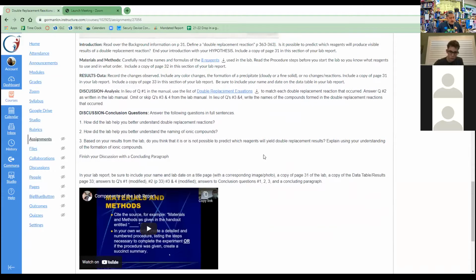Okay, so let me get a well plate, and then we'll get these chemicals together and see what happens. Okay. All right, I don't have my 96 one, but I have the other well plate. Oh, and I don't have the camera up, so let me swap the... stop.